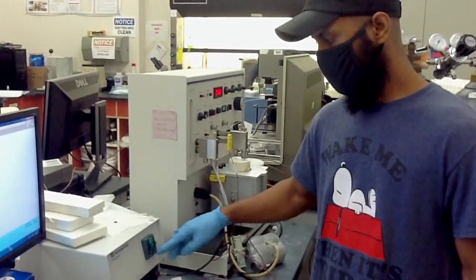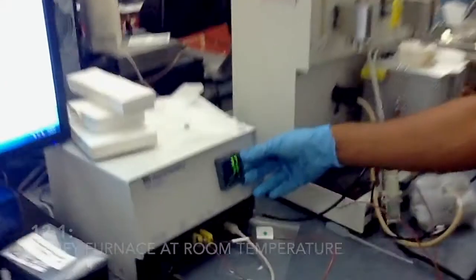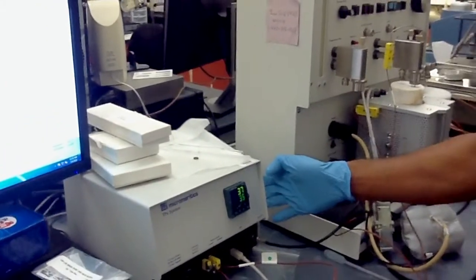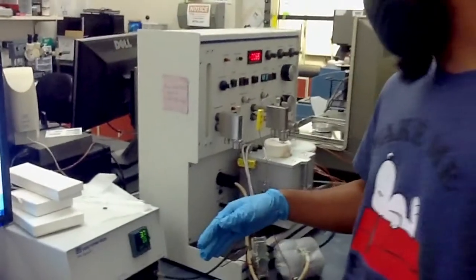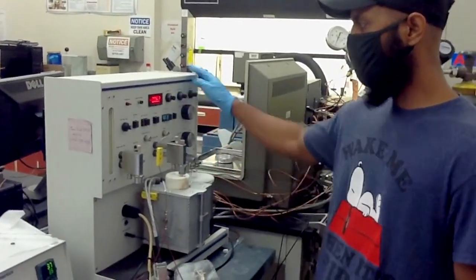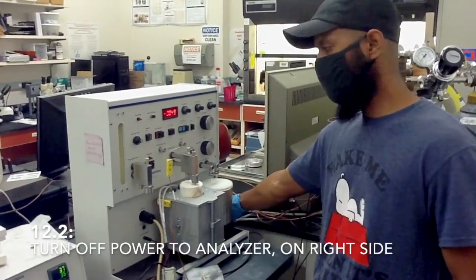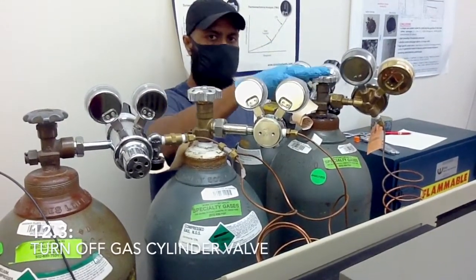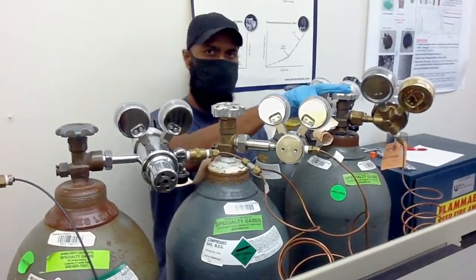As you can see, the temperature of this setup has already come back to room temperature. So you don't have to worry about temperature or turning on the oven or furnace. It already came back to 0. Now the next step is to turn off the gas and also turn off this instrument here, which is in here. You go and press turn off. And after your experiment, don't forget to turn off the valve. Don't forget to turn off this gas cylinder valve.